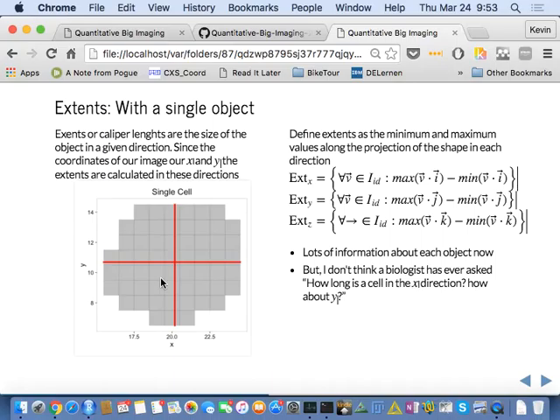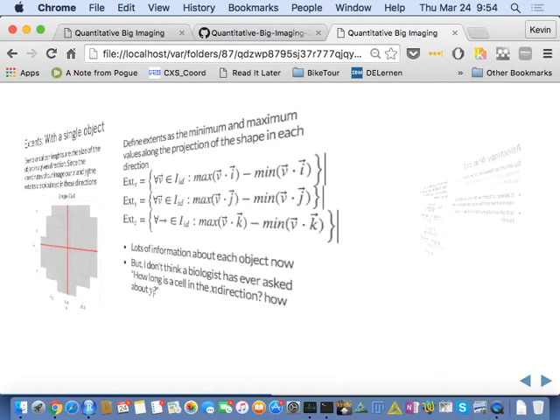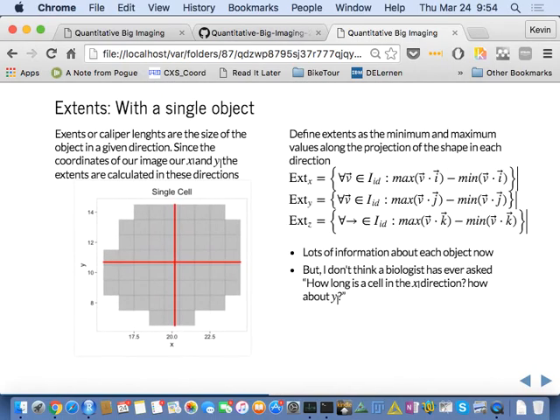That would be the most complicated approach. I mean, that's the one we ultimately use. Usually people guess something slightly simpler, like rotating the object around and measuring the extents until the extents are highest, and then you know the length in the longest direction. Of course, that's not very efficient, but it is intuitive of what you're doing with the sample.